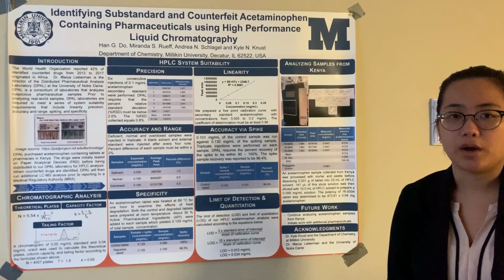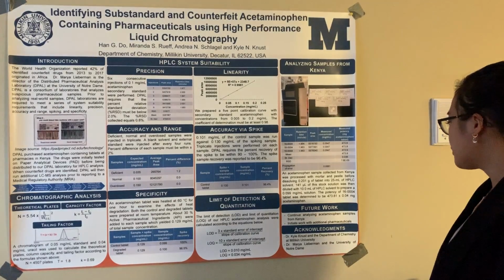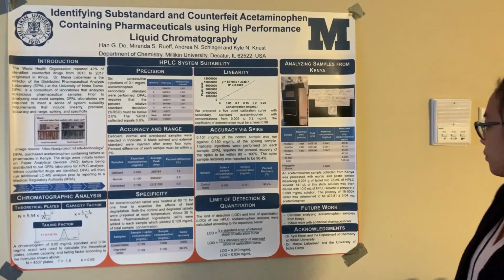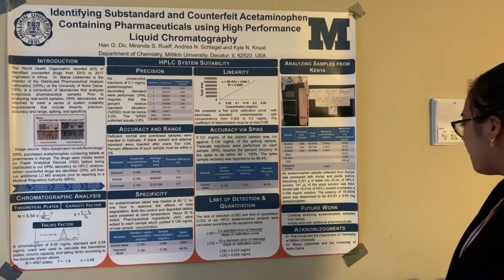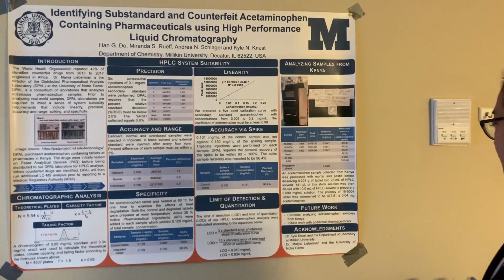Then I pipetted 141 microliters of the stock solution and diluted it with 10 milliliters of HPLC solvent, which yielded a 0.099 mg/ml solution. The potency of the tablet was determined to be 473.81 plus or minus 0.04 milligrams acetaminophen.